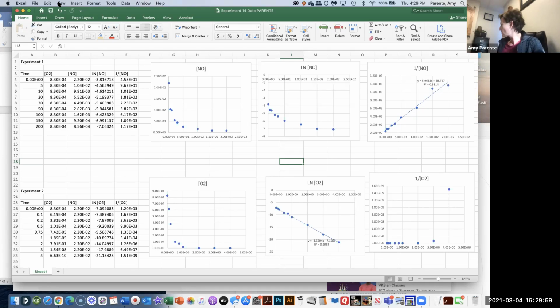We need to have a little bit of a procedure. Let me see if I have my lab notebook in here. Yep, here it is. So we are doing lab 15, calculating an equilibrium constant. So like you had with your last lab, writing a pre-lab, your pre-lab is basically taking a stab at writing the procedure.